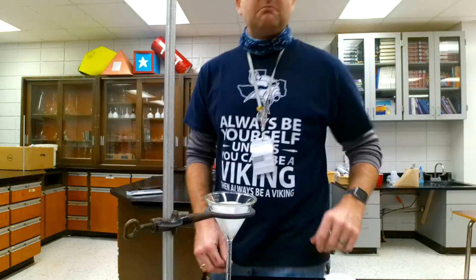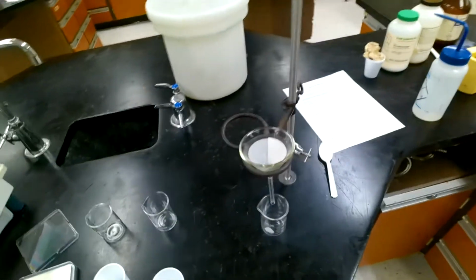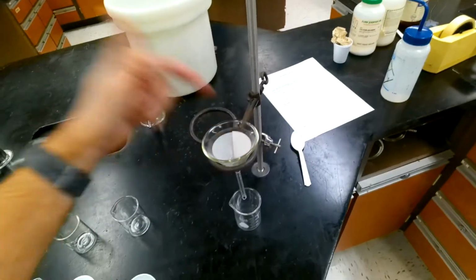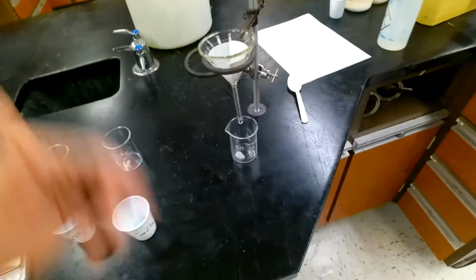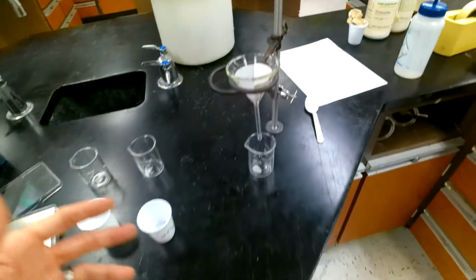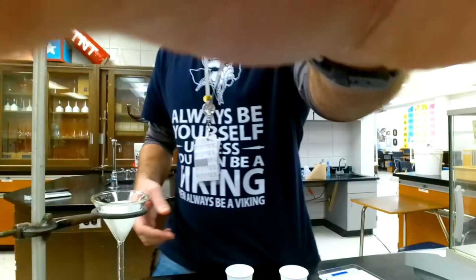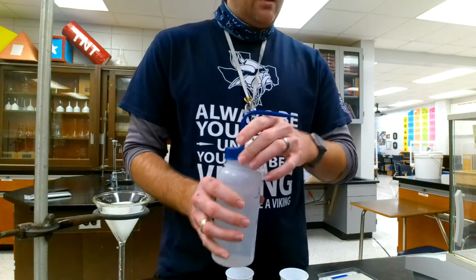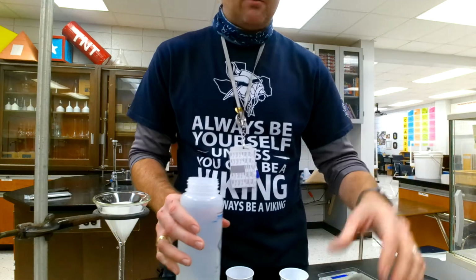Now another important thing is that we're going to catch all of our product, all that solid that's going to form, in here, and all the stuff that comes out we don't care about. So you can add as much water as you really need to get it to dissolve. The amount of water is one of those cases where you just don't have to worry about it. I'm going to skip ahead because you guys don't need to watch me dissolve stuff.